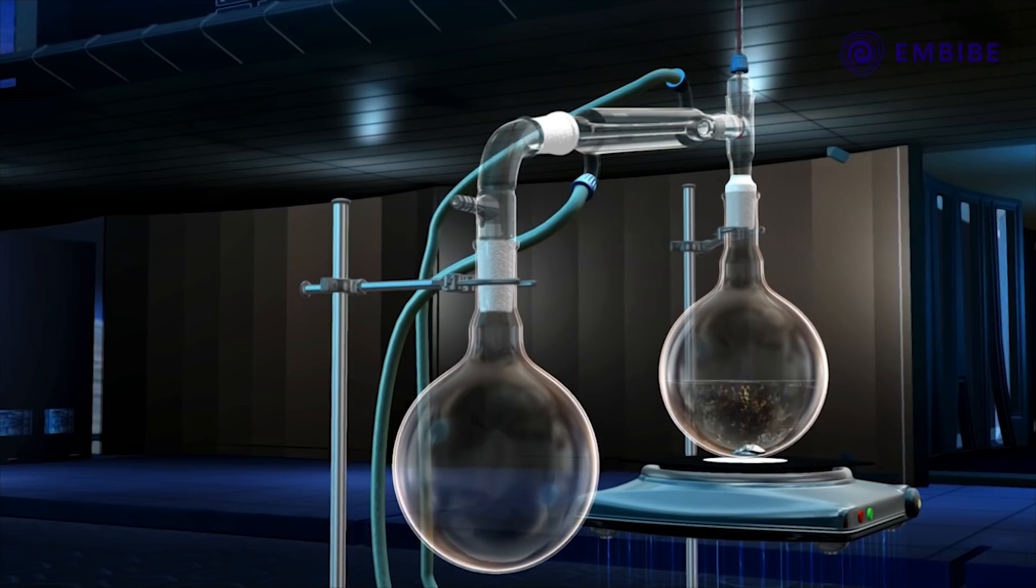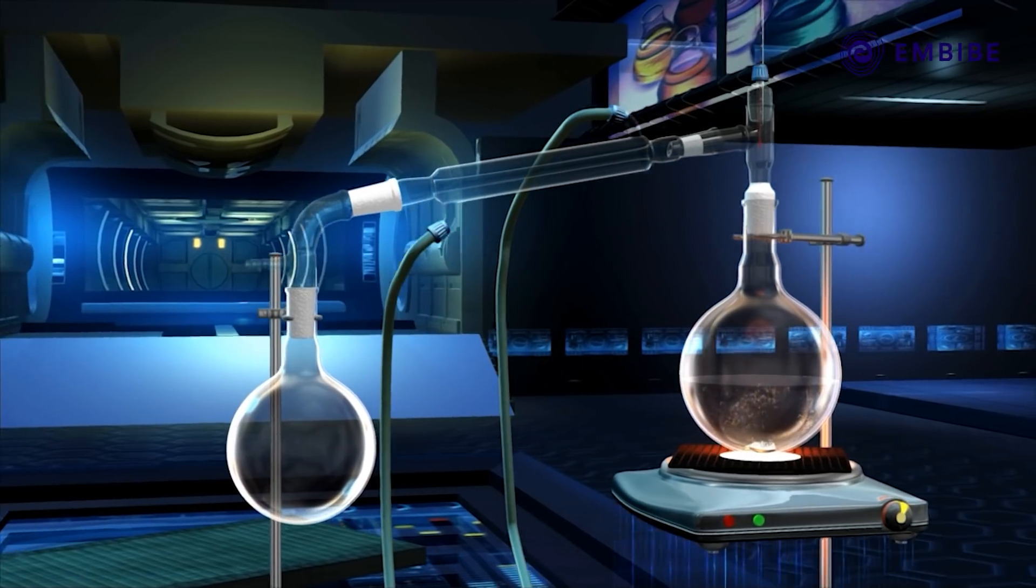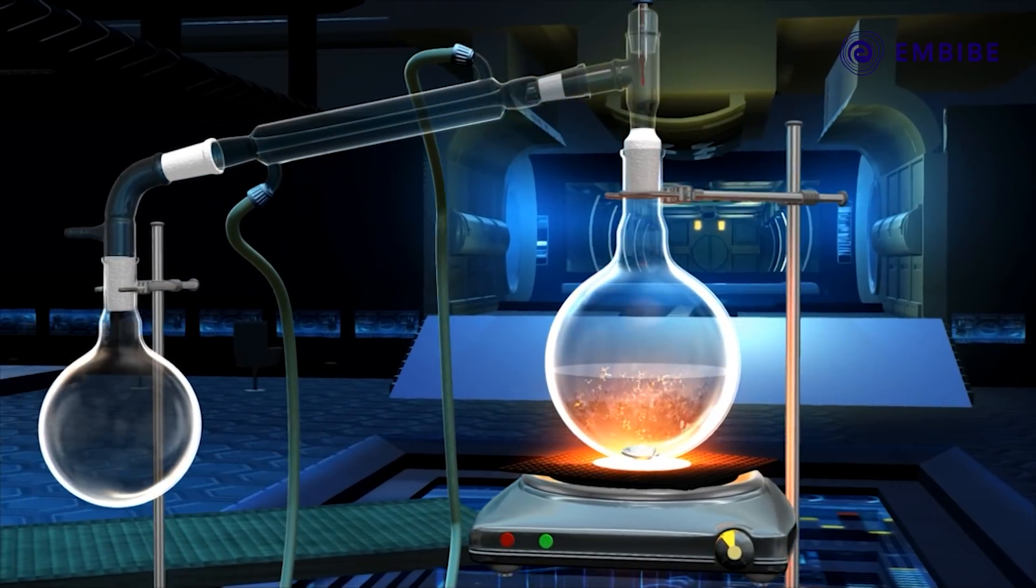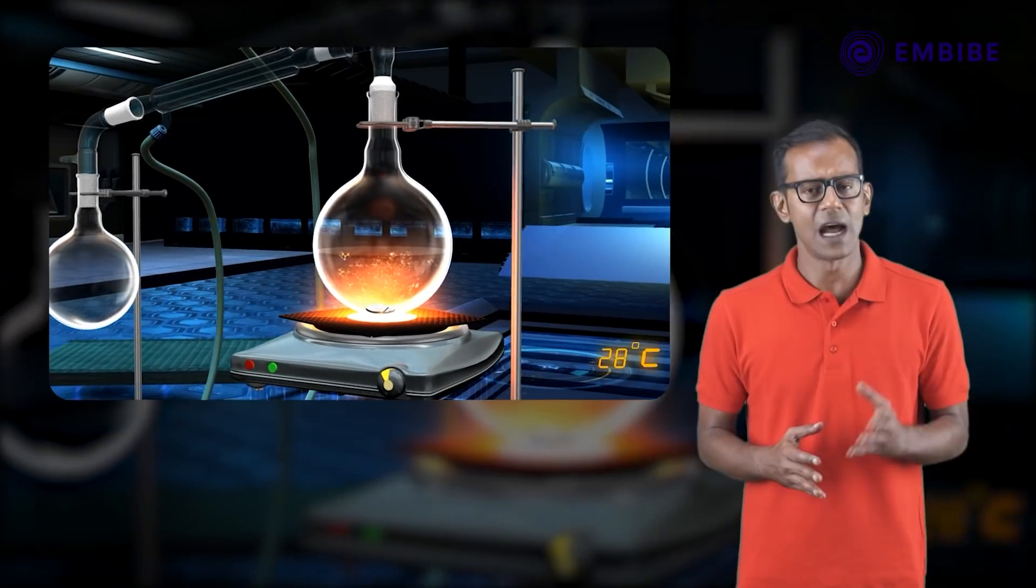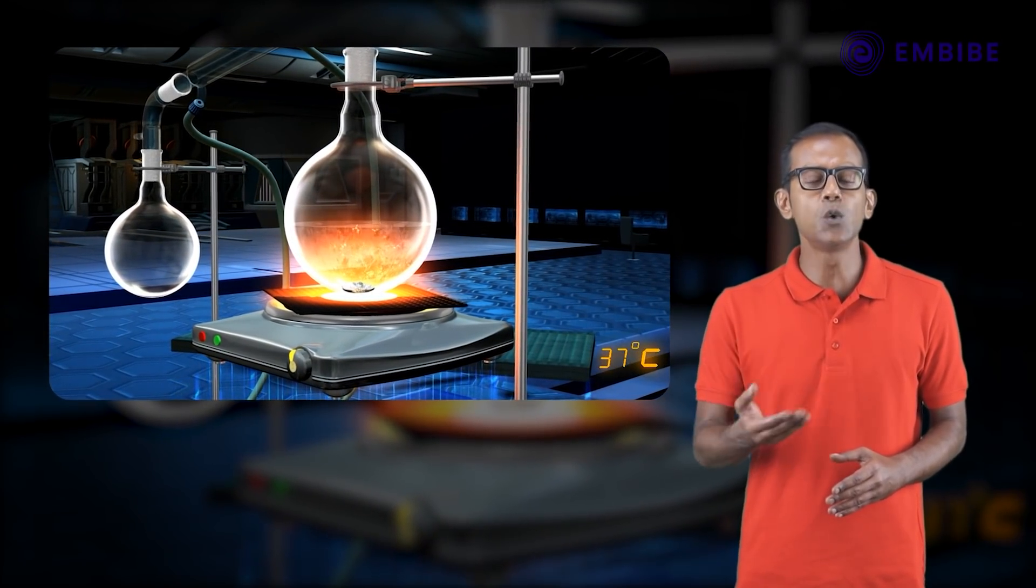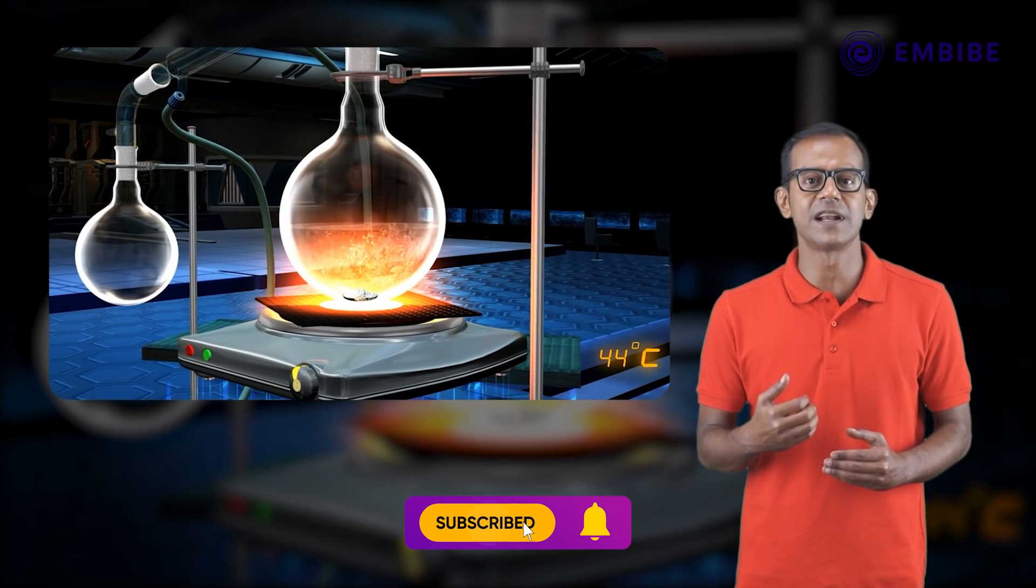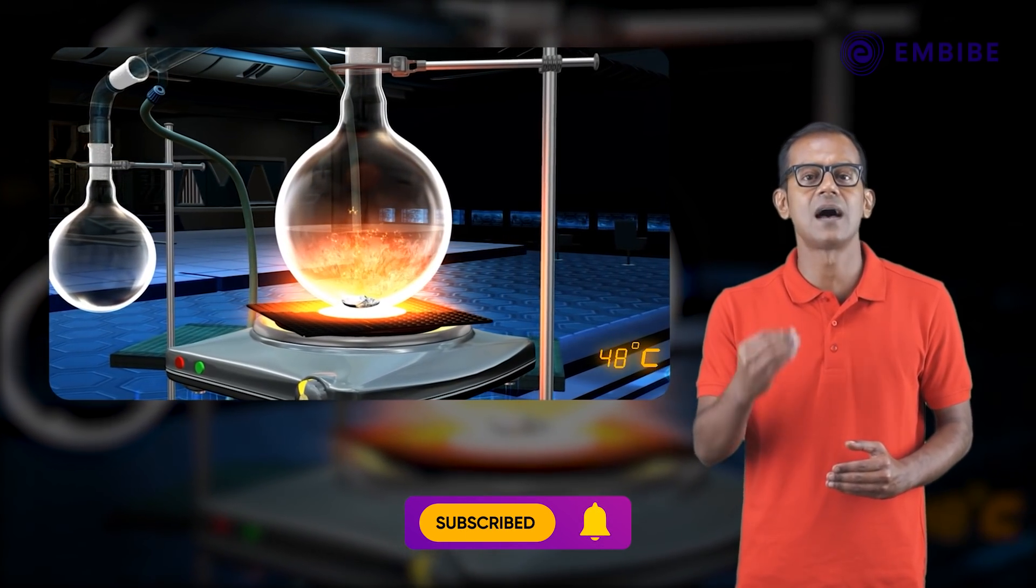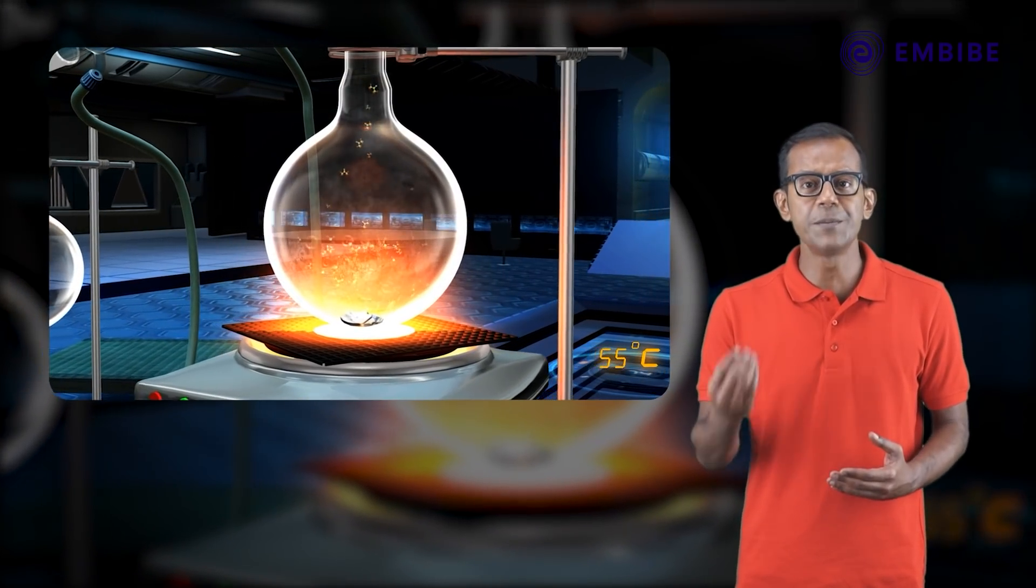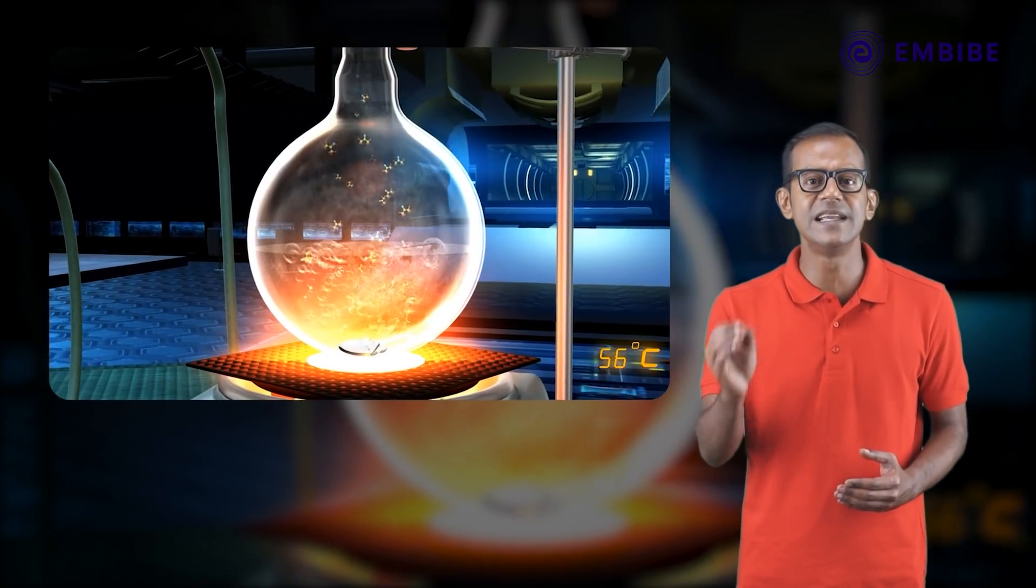Now that we have assembled the apparatus for simple distillation, let us start the process. Turn on the hot plate. The mixture of the two miscible liquids gets heated and the thermometer records a rise in temperature. After some time, acetone begins to boil and changes into its vapors while water remains unaffected as it has a higher boiling point.